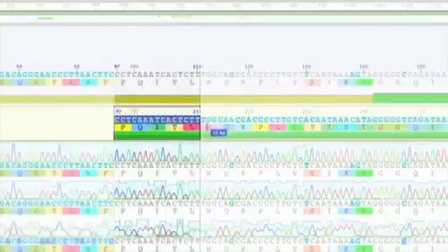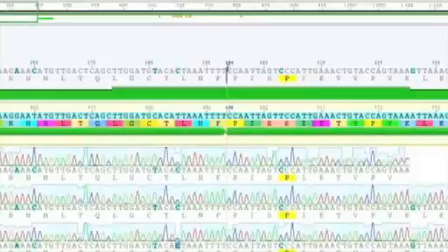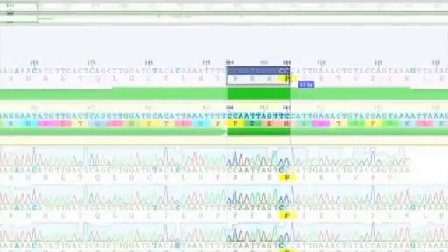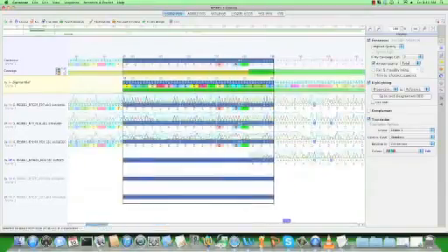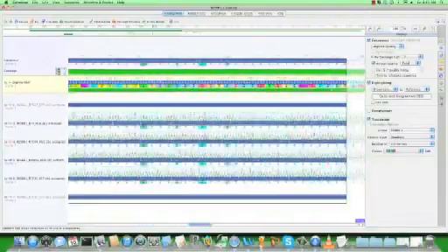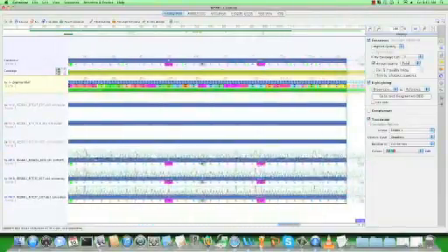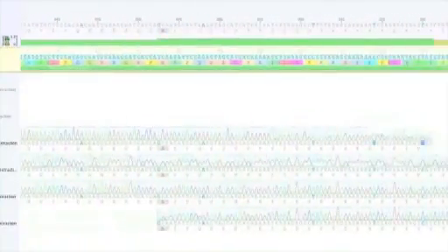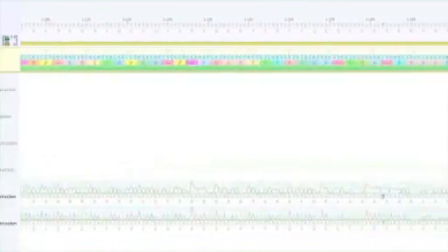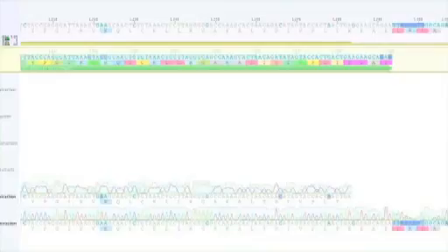The beginning of RT will start with P-I-S-P-I-E. Extract the contig region covering the beginning of protease to the 300th RT codon. During this process, also check for insertions or deletions. Go through the consensus sequence of the extracted contig. Identify any ambiguities and verify positions with mixed bases by inspecting quality, symmetry, heights, background and shoulders of the flanking regions of the bases.